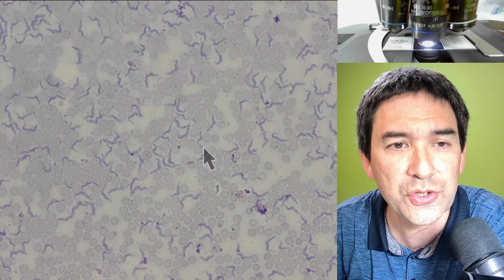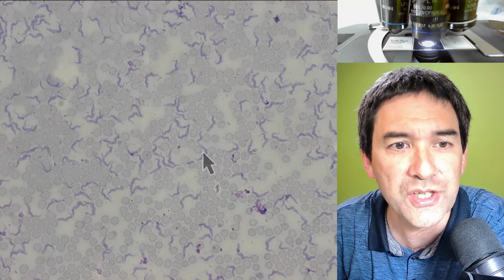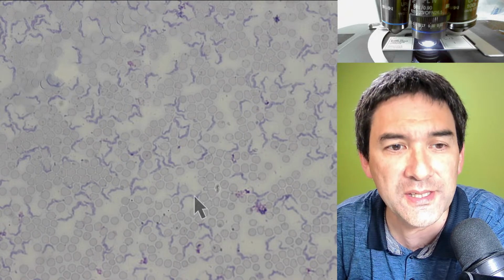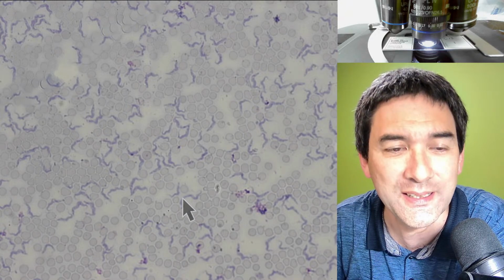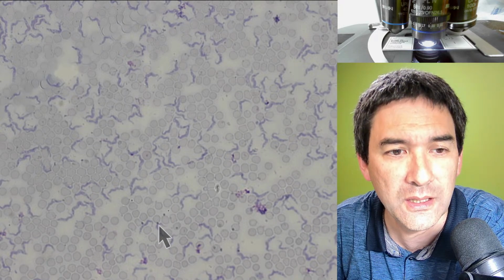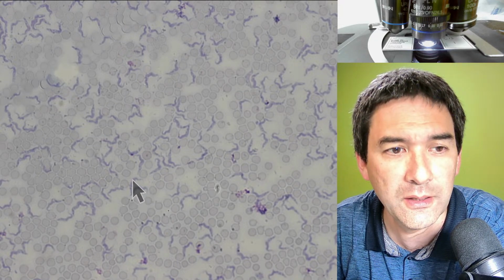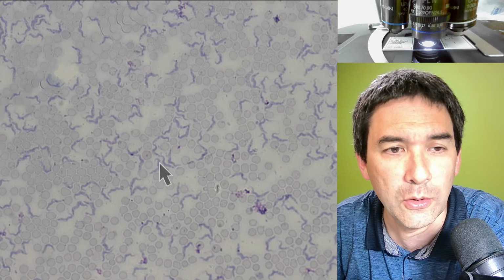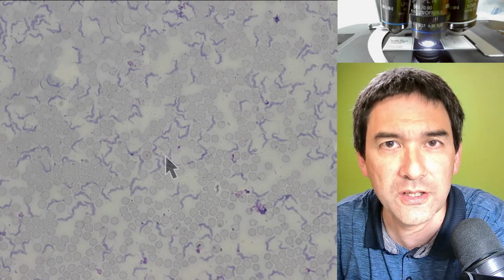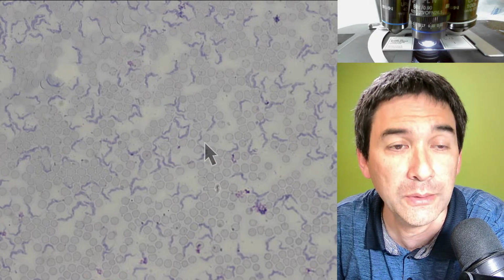And then do you see those dark worm-like structures? These are protozoans called trypanosoma. These are the parasites that cause sleeping sickness. And they are basically carried by the so-called tsetse fly. They are all in the blood and they reproduce in the blood. And this is a sample of these trypanosomas as they are in blood.